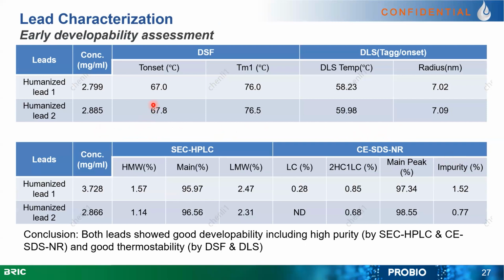At last, we carefully evaluated the developability of these two candidates with a panel of biophysical studies, including thermal stability, aggregation, SEC, and CE-SDS purities. Both candidates gave desirable performance, suggesting that these two are very viable candidates for cell line generation and process development.